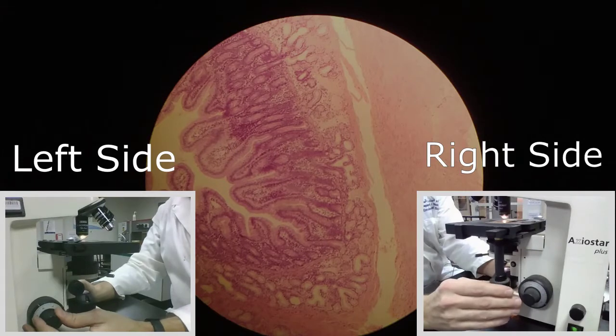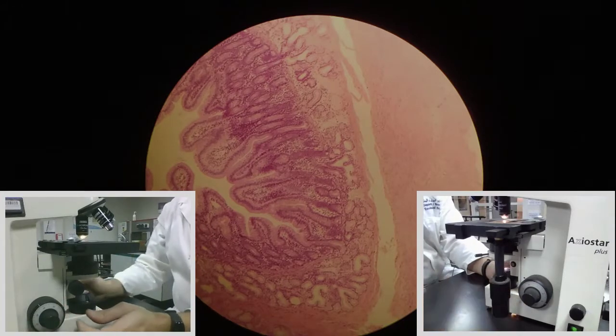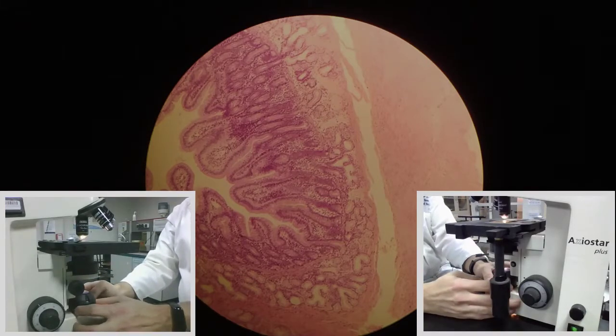This is probably as good as it's going to get. Now what I want to do is start adjusting my lighting system, my condenser lens assembly. The first thing I'm going to do is close off the field iris diaphragm.